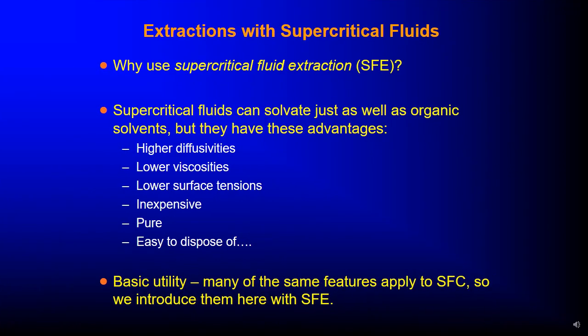So, extraction with supercritical fluids. Why use supercritical fluid extraction? Supercritical fluids can solvate just as well as organic solvents, but they have advantages: what we call higher diffusivities, lower viscosities, lower surface tension, and they are inexpensive, pure, and easy to dispose of.